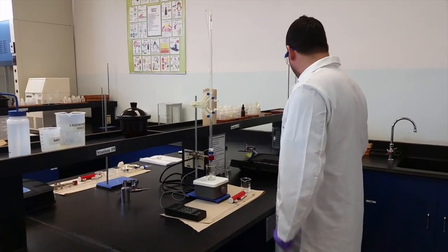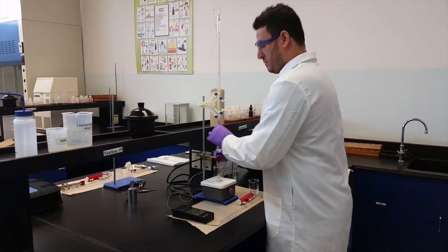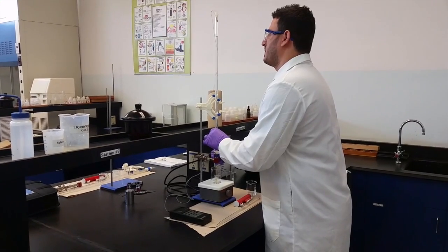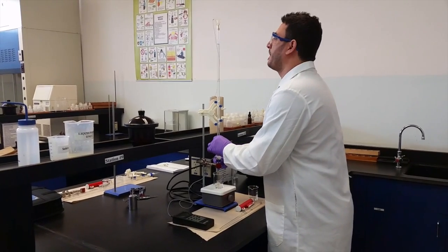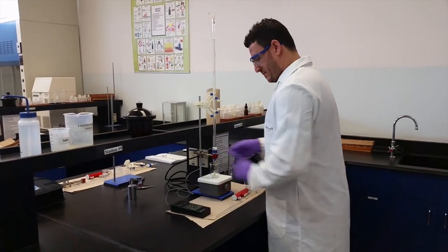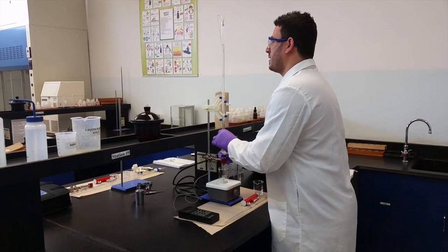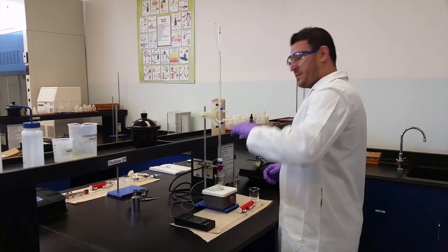and you record the value of the pH after adding each volume of the base. 2. 3. 4. Now, at the beginning, you will not notice a big change in the pH because the pH is slightly increasing.